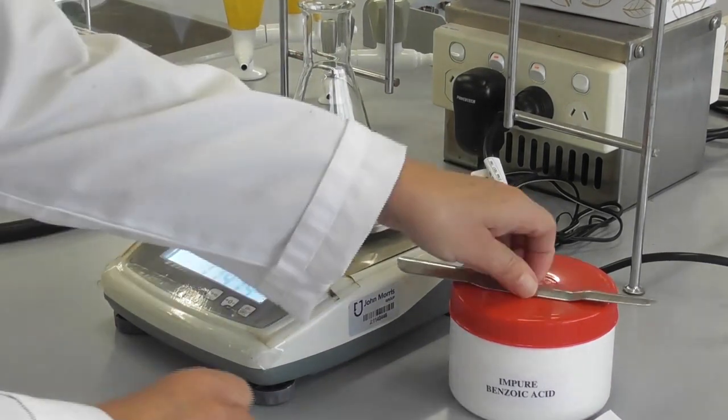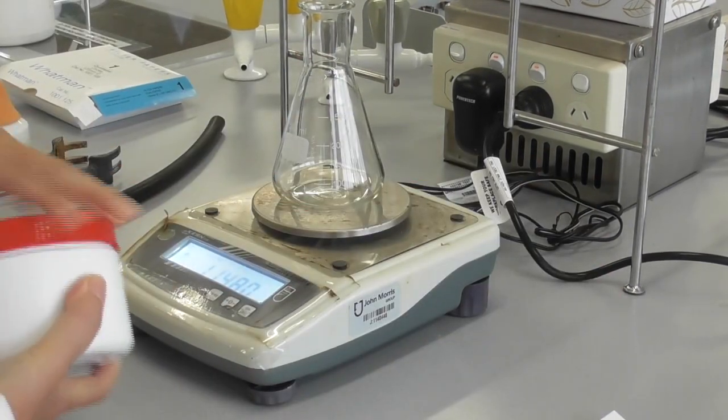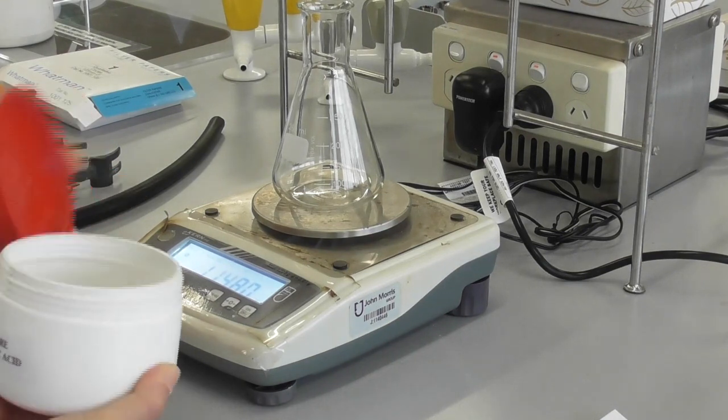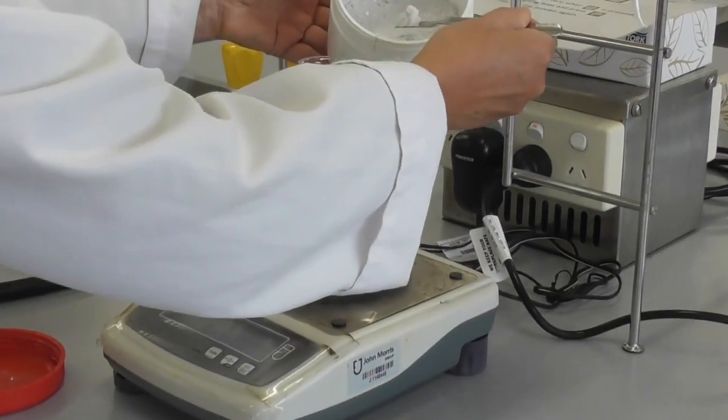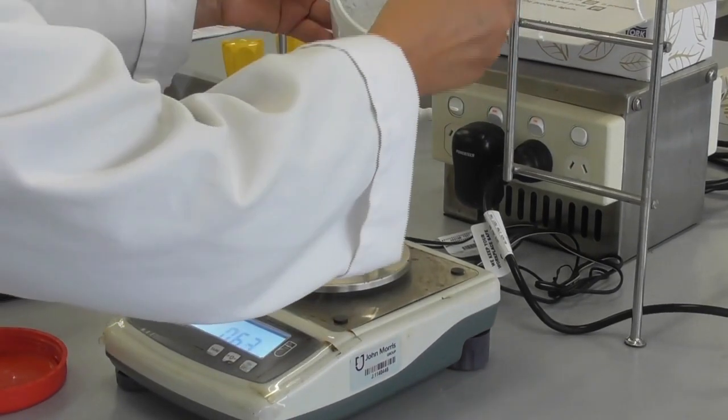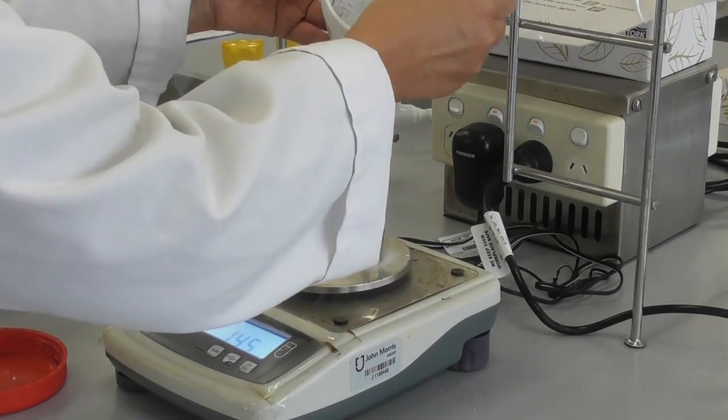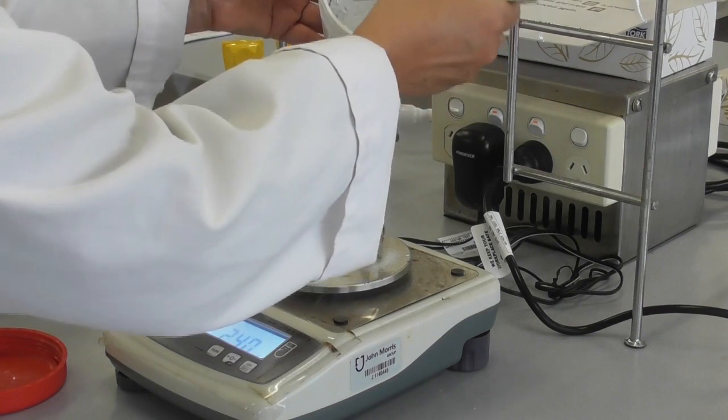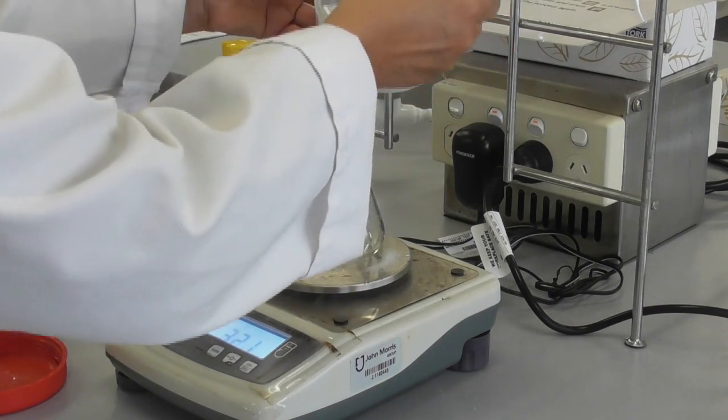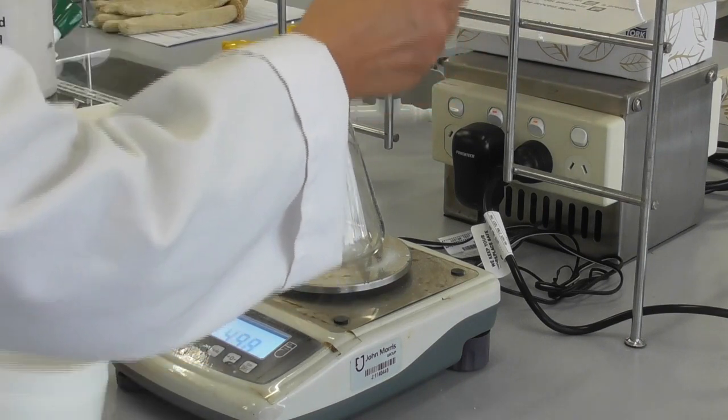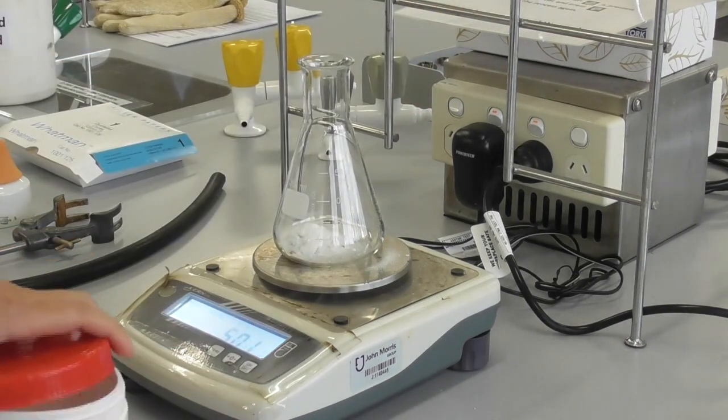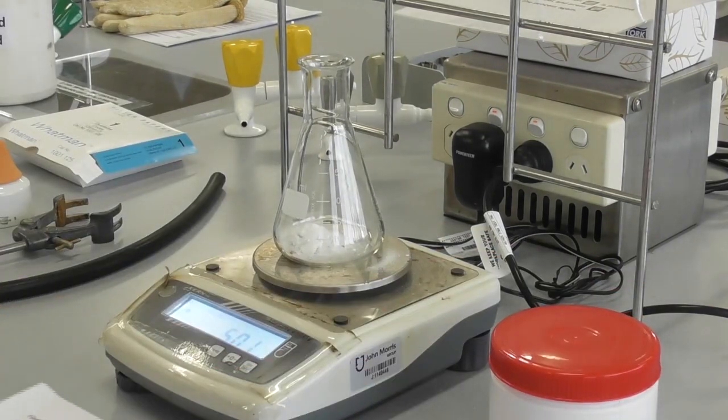We put a 250 ml conical flask onto a top loading balance and weigh out about 5 g of impure benzoic acid. It doesn't need to be 5.0 g but we do want to write down the mass used for the experiment.